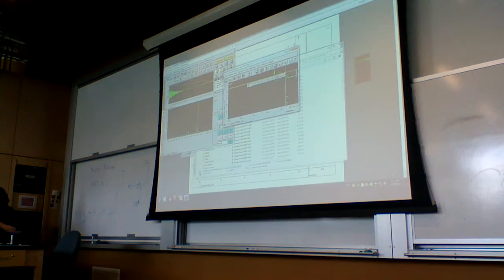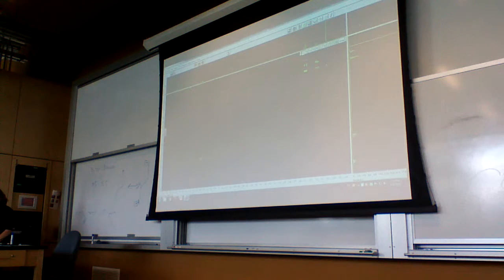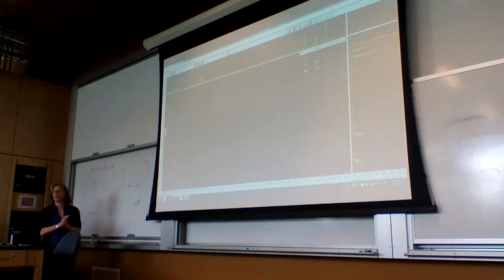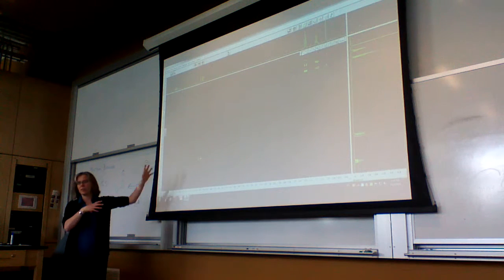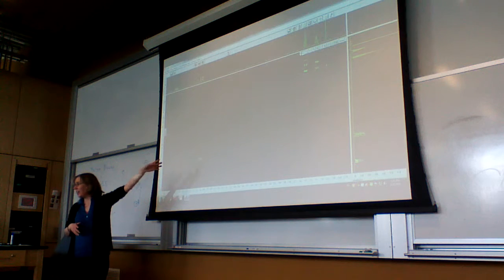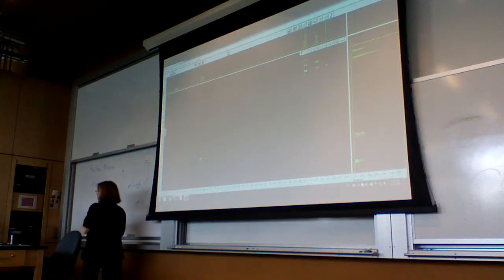The y and the x-axis are going to be at low resolution with your first COSY. That's actually just telling you what it saw in the experiment, but it doesn't have very high resolution. But typically you take a proton NMR and a carbon NMR separately, so you're going to have much higher resolution data. And it's easier to bring those in here so that you can correlate the peaks and see the actual splitting. So I did that.